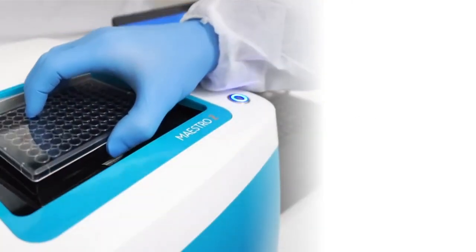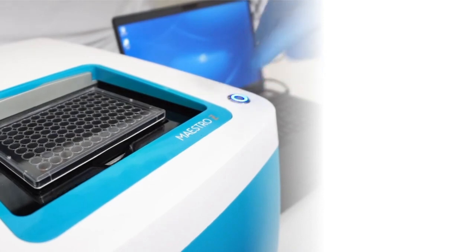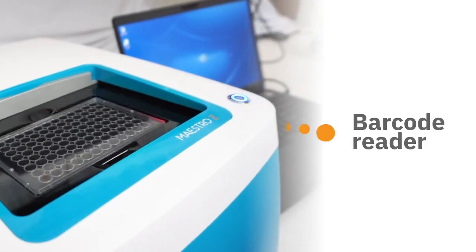The integrated barcode reader ensures all data is automatically associated with the correct assay plate.